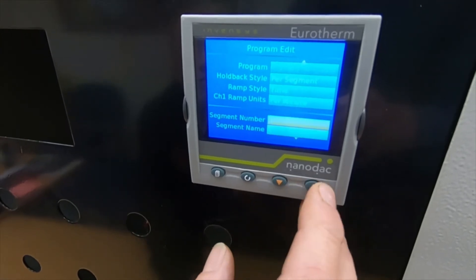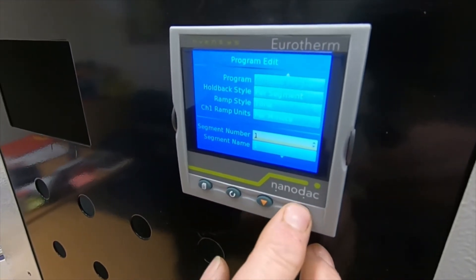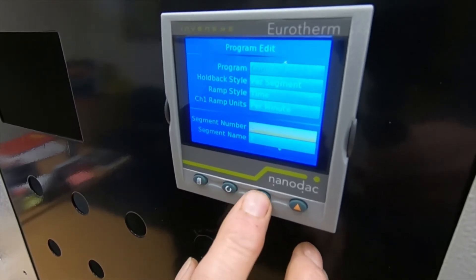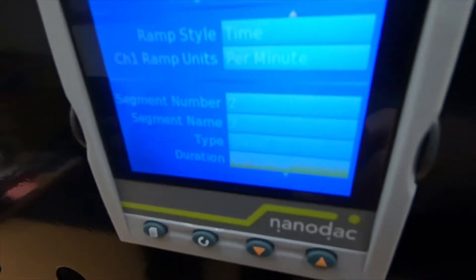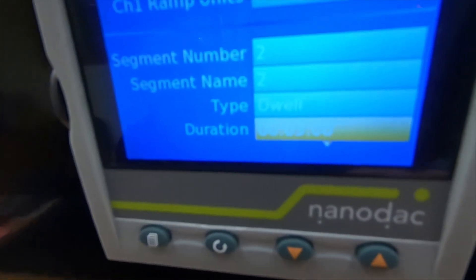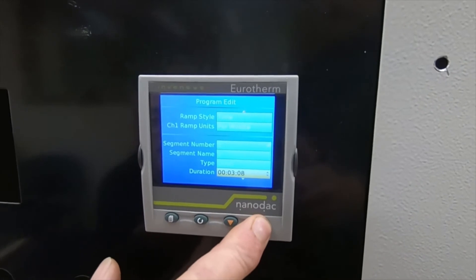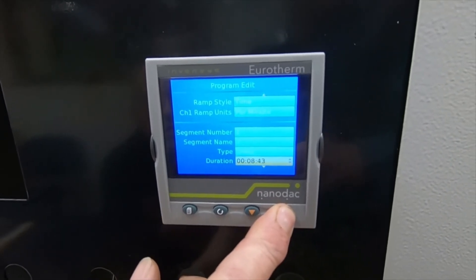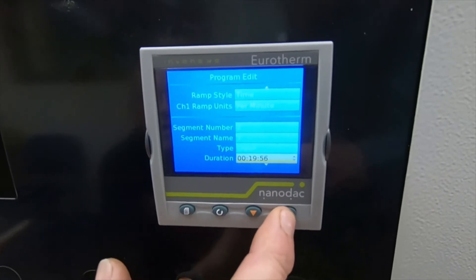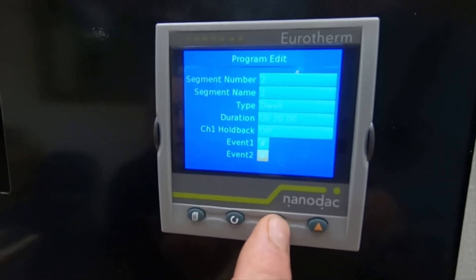Now we're back to your segment numbers. The next step would be segment two. Highlight it with the scroll button and change it. Scroll down and you can put whatever name you want. In this case it's a dwell — that means you hold that temperature for any length of time you want. At the moment it shows three minutes, but say you want to change that to 20 minutes. Highlight with the scroll button, use your up cursor to get to 20, then use your scroll button to accept. Hold back is zero.